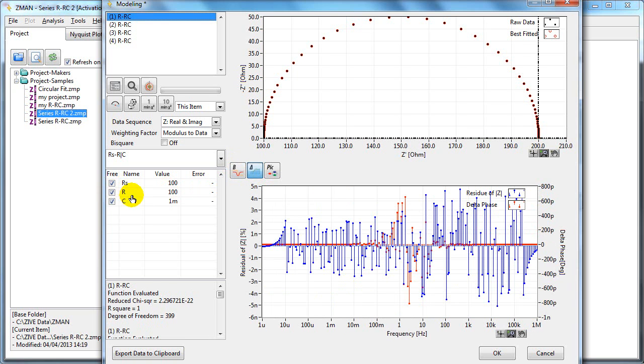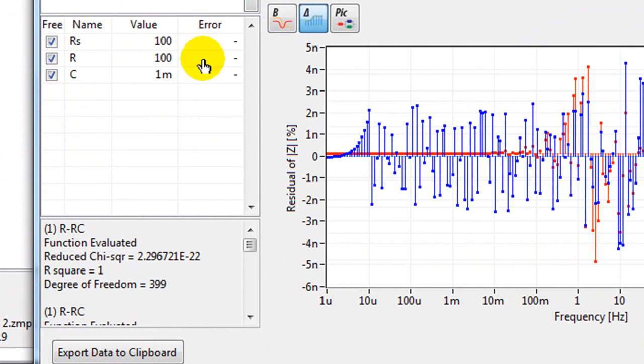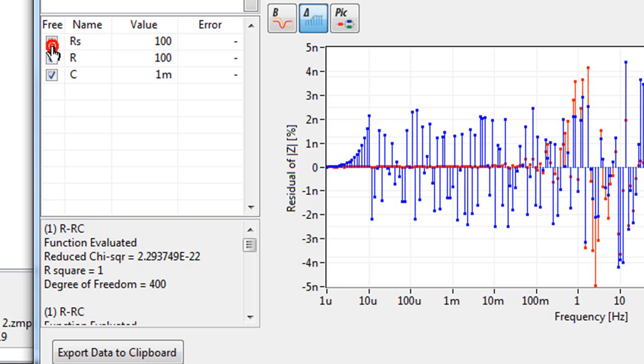The parameters for the fitting are shown here. Here you can tell the software whether to make the parameters free or fixed. A tick means the parameter can be free, positive or negative. A black square means it's free but has to be positive. If it's unticked, it's fixed.